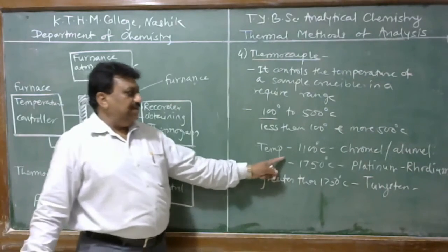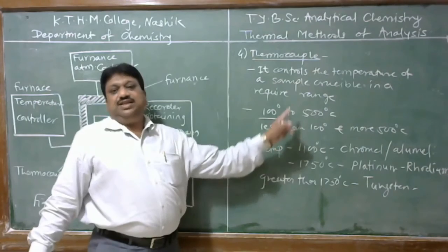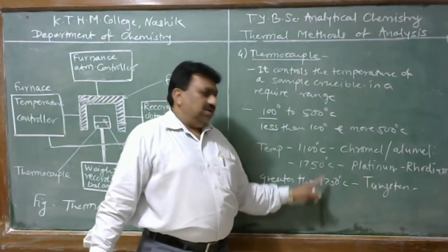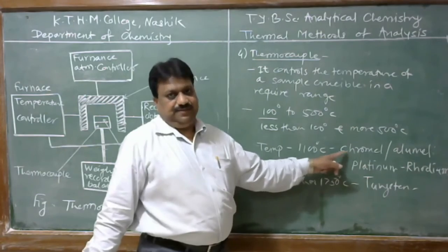Depending upon the temperature range, the thermocouple is selected.